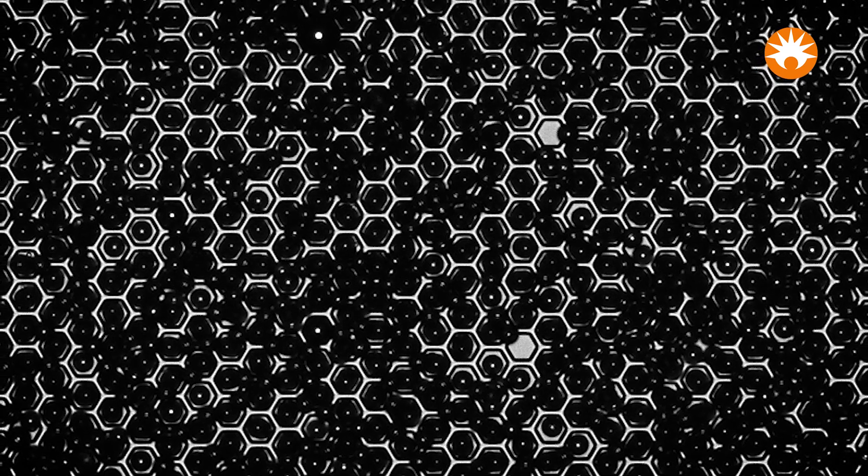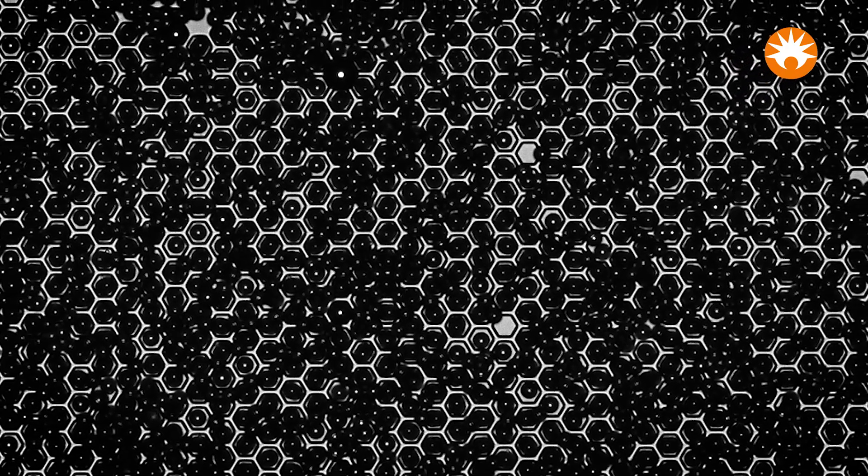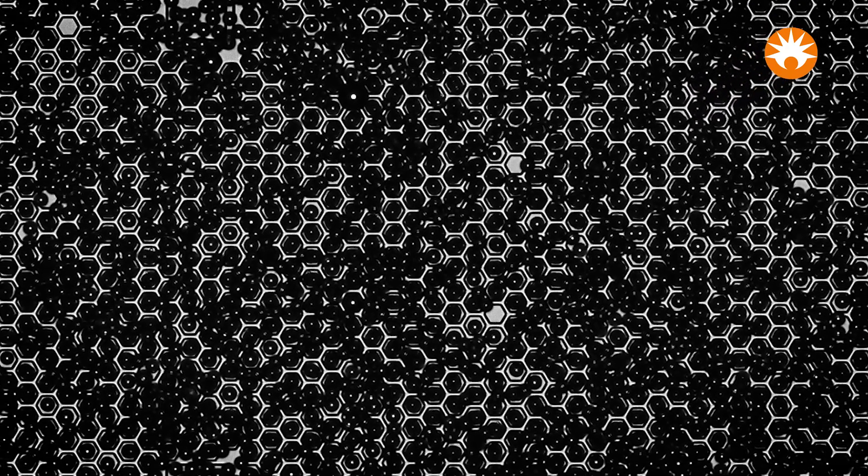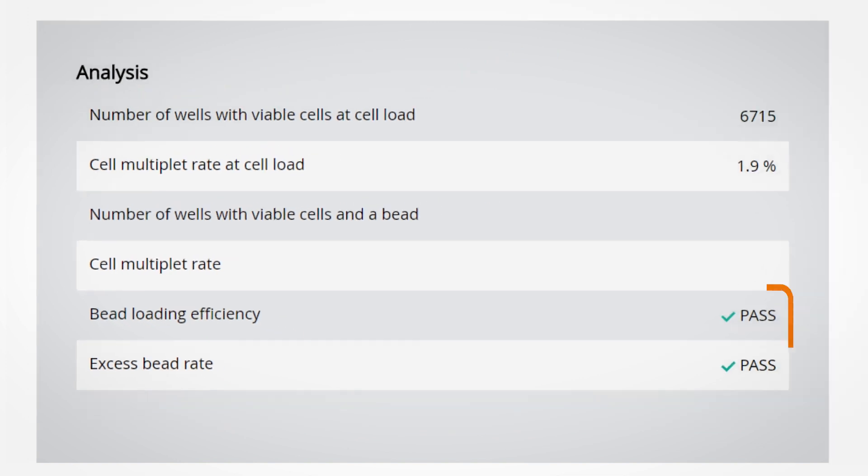An excess of beads is loaded into the cartridge at this stage to ensure nearly all wells are occupied by a bead. The scanner will report back two pass or fail metrics for this stage: bead loading efficiency and excess bead rate. Continuing with our experiment, we can see both metrics passed.